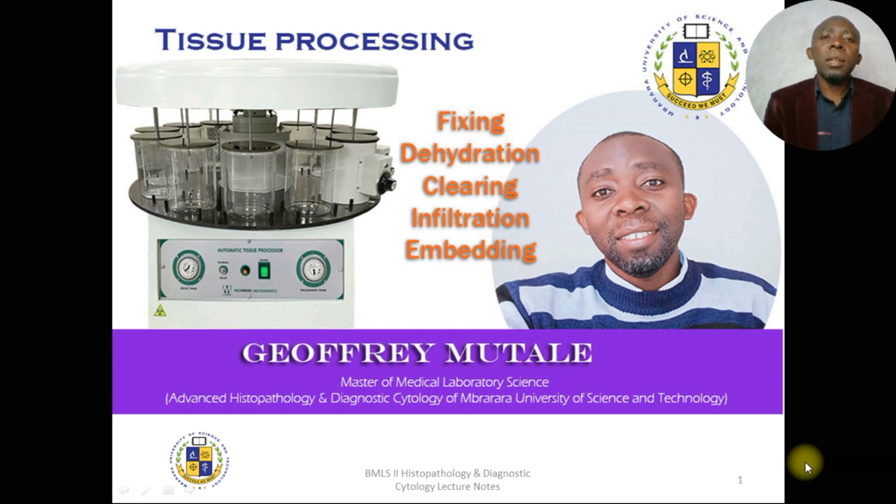So just like the name goes, this is the procedure that we are going to take the tissue through, from the time it is harvested from the body to the time it is put on the microscope slide and can be examined under the microscope to look for any pathological changes that we can be interested in.